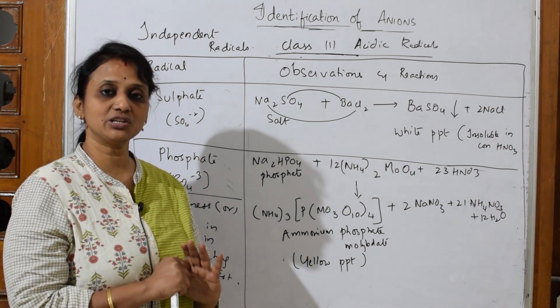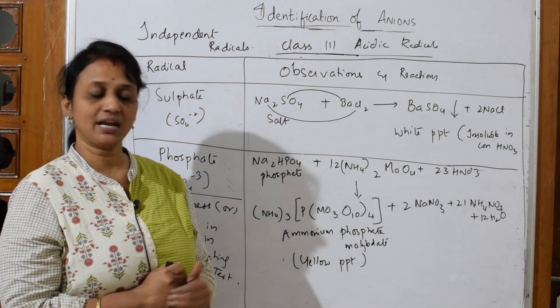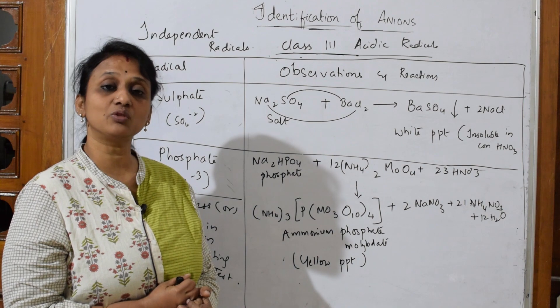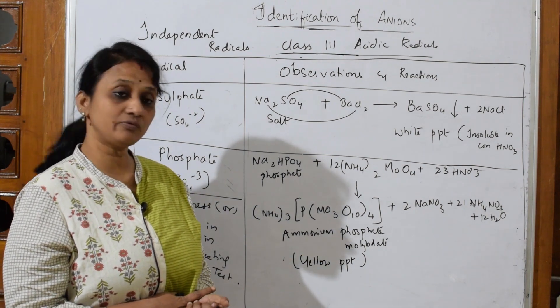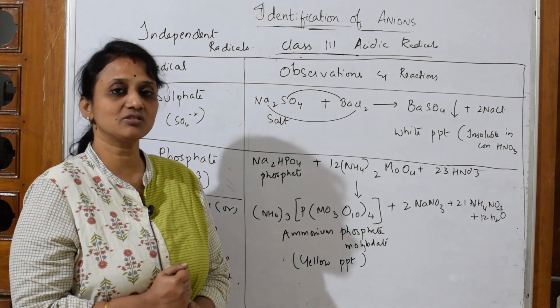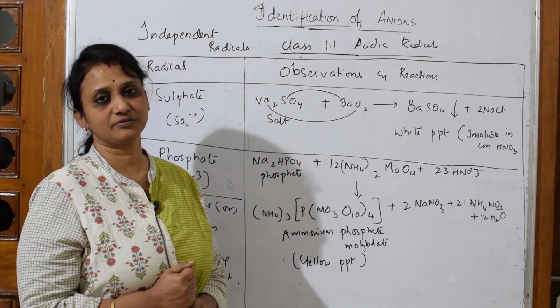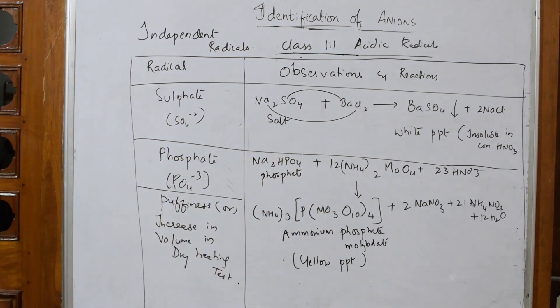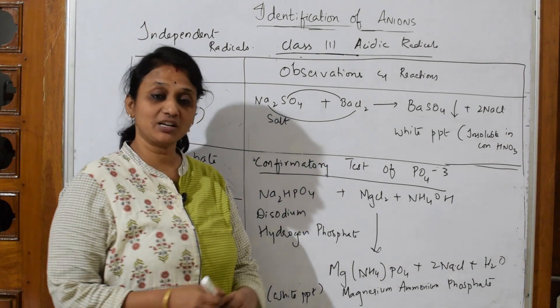So identification is done: the dry heating test showed increase in volume, and with ammonium molybdate we got a yellow color precipitate of ammonium phosphate molybdate. However, this yellow PPT is identification only — not yet confirmation. Let's come back and do the confirmatory test for phosphate.